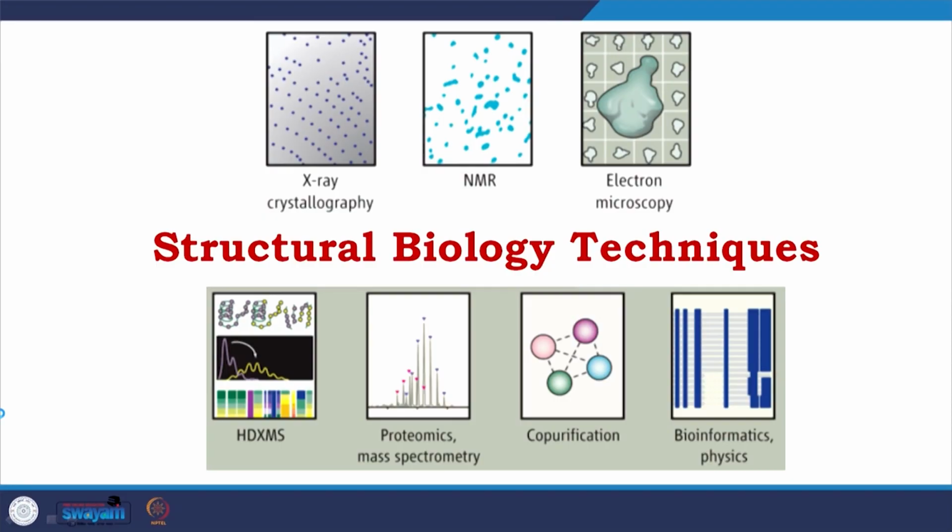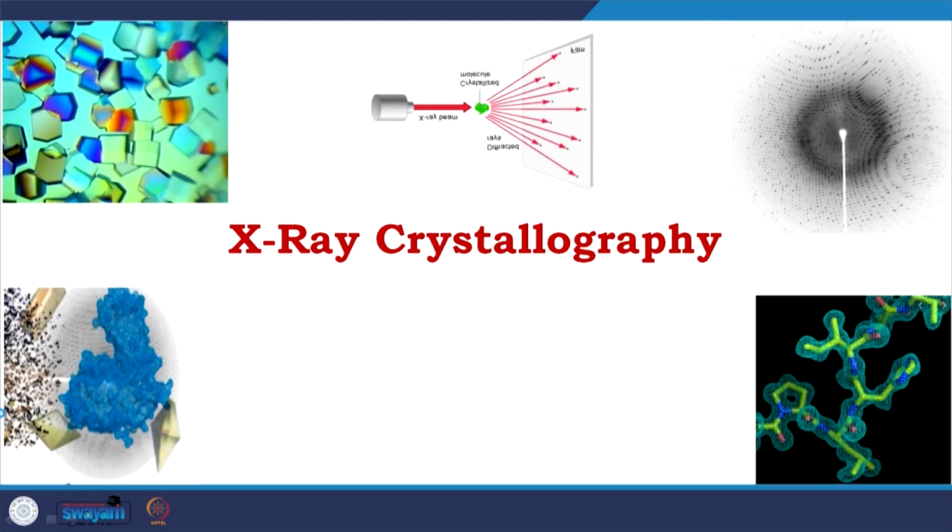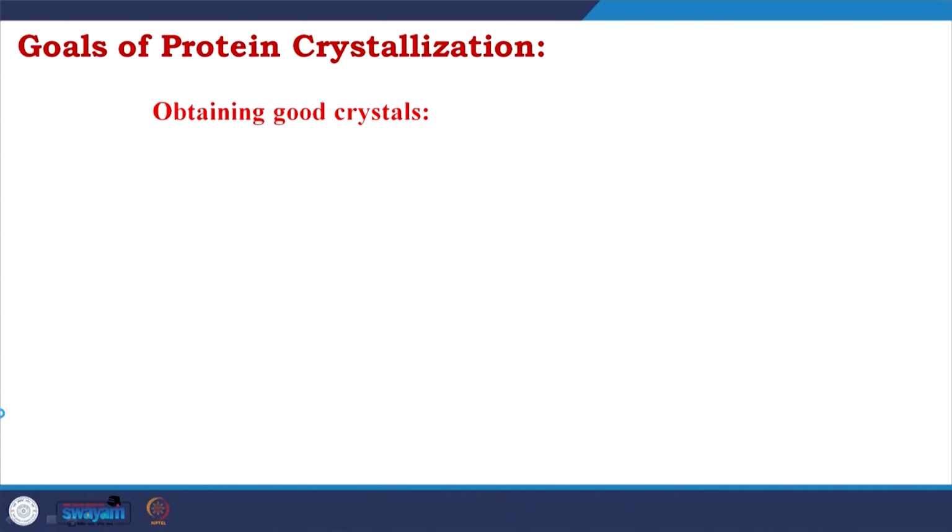It is the continuing module where we are discussing structural biology techniques, and now we are continuing with the discussion of X-ray crystallography. I have talked about the background and the starting of protein crystallization. Now in this class we will start with the goal of protein crystallization.